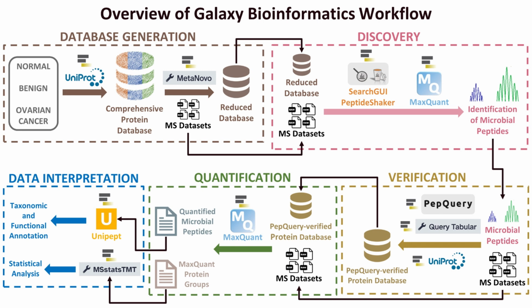The discovery module, as you can see in the top right corner, uses two peptide identification programs, SearchGUI Peptide Shaker and MaxQuant, to identify peptide and protein sequences via sequence database searching. This will allow us to successfully retrieve reliable microbial peptides.